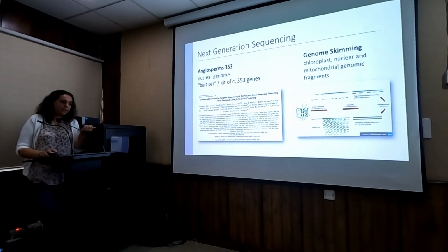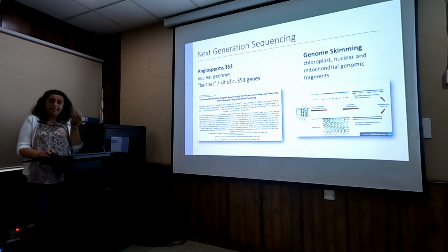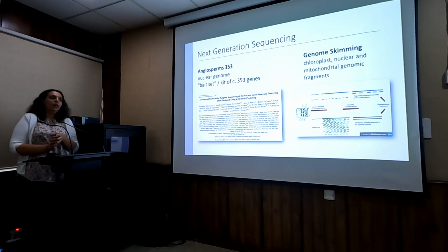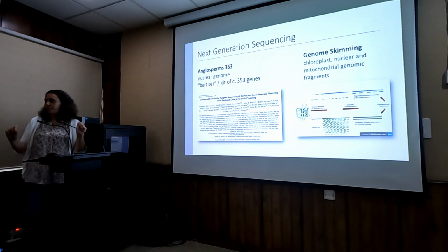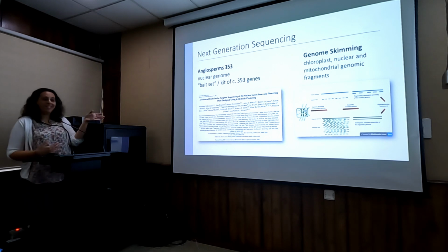So what colleagues, some of them from Kew, have developed, but it's been a combination of people from different institutions, is a kit that basically will fish out about 300 nuclear genes out of your DNA just at once. So that's basically what it does. And that's great because you get a lot of nuclear data. And then they're now using it for angiosperm level phylogenetics, so kind of a new APG, a new classification of angiosperms. And so they're proving that nuclear data can be used at higher levels after all that I've said.